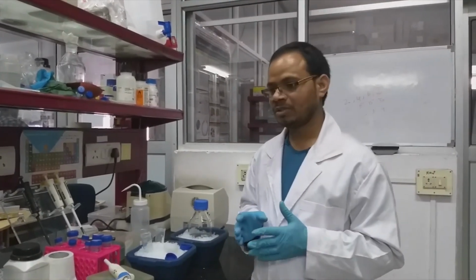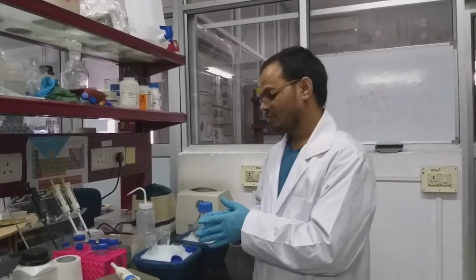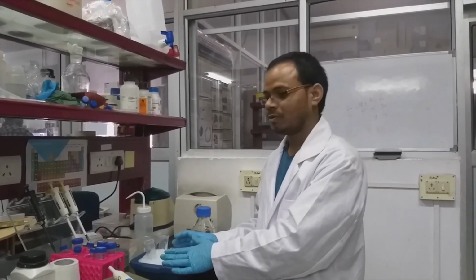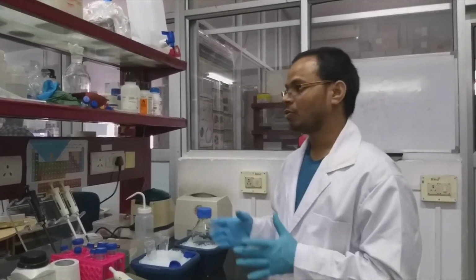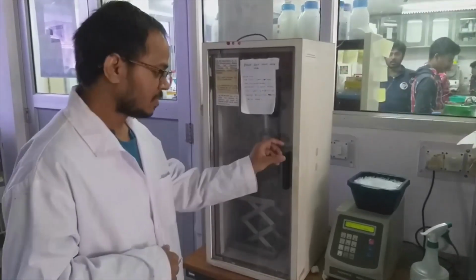And also during sonication, we should note that a high amount of energy is generated. So to dissipate that heat, we will use ice. So I will show you how to operate the sonicator instrument. This is the sonicator.